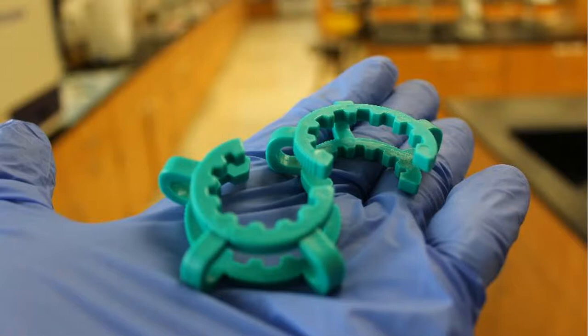Therefore, I do need T-clips, and I need these glassware clips that will connect everything together and hold everything in place. All right, now let's talk about reagents.